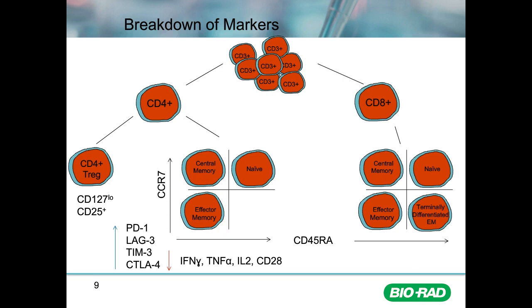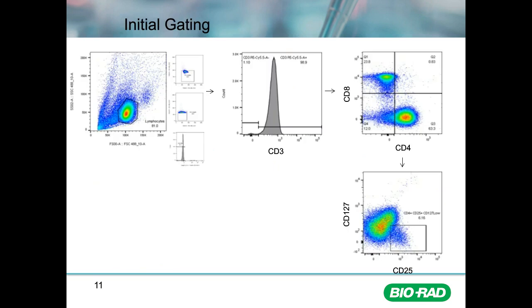Cells were first gated on the lymphocyte gate and doublets removed using forward and side scatter parameters. The live cell population was then identified using a VivaFix dye. As you can see, a majority of the sample is CD3 positive, as expected for a pan-T cell sample used in the in vitro model. Within the sample, a distinct population of Tregs can be identified. Tregs are important because checkpoint inhibitors reduce apoptosis in these regulatory T cells, and regulatory T cells play an important role in limiting inflammation and suppressing T cell function.